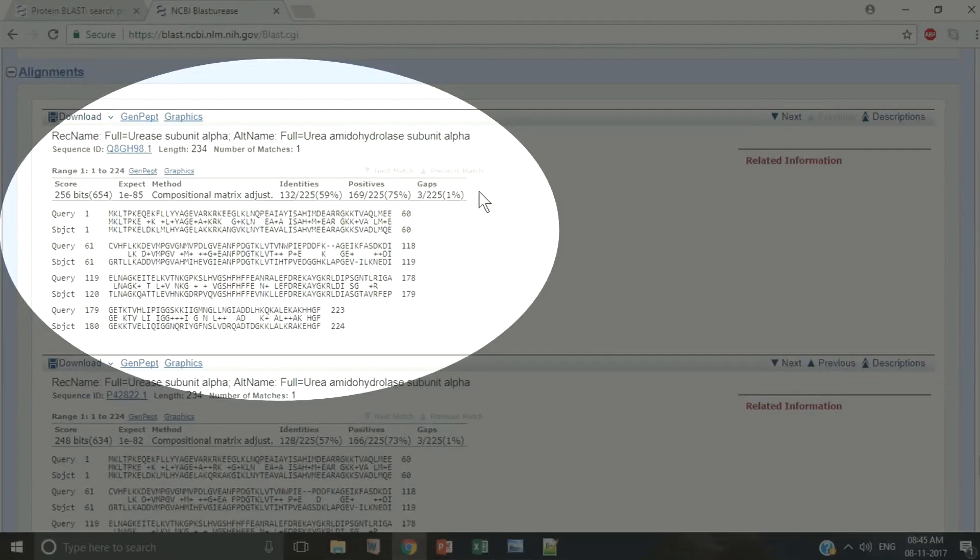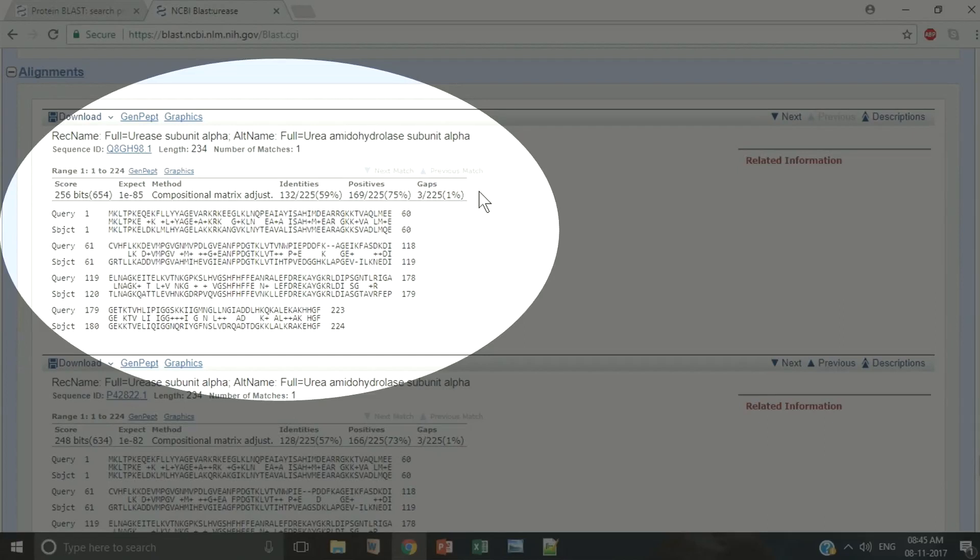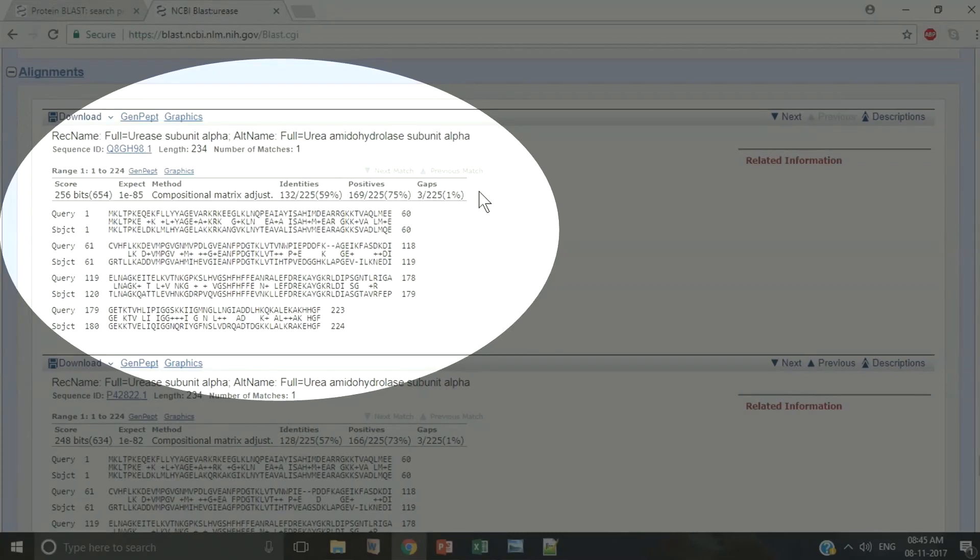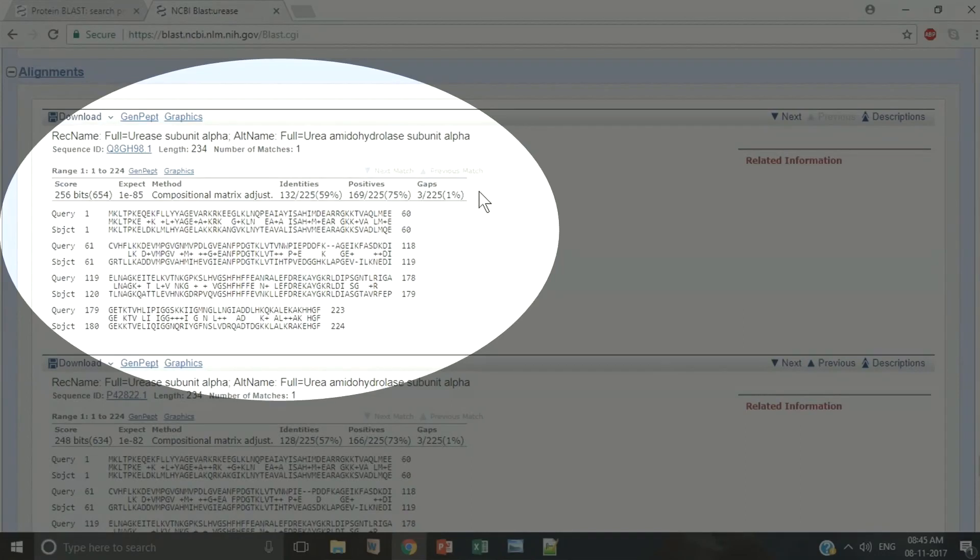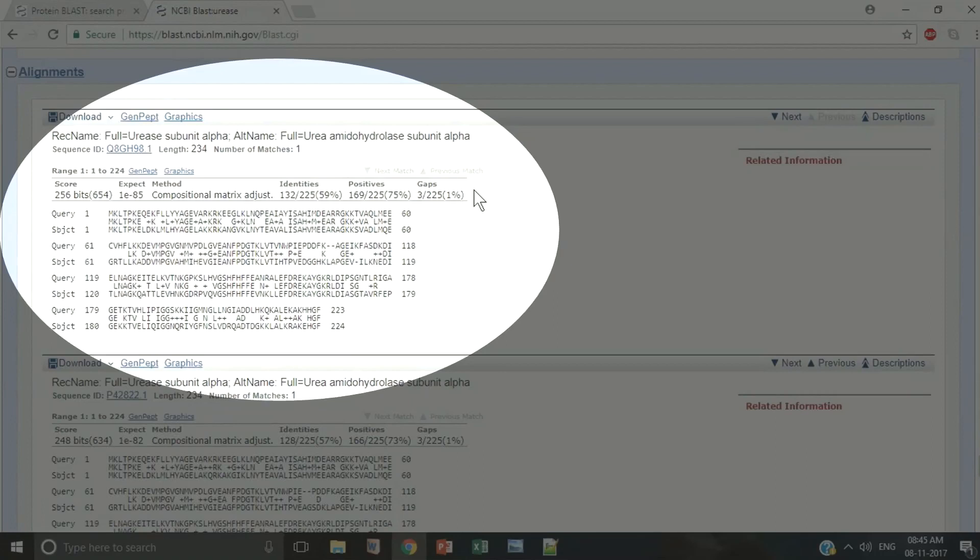The sequence alignments show us how well our query sequence matches with the target sequences in the database. Each alignment block begins with the summary of the maximum score, E value, sequence identity, and the number of gaps in the alignment. The alignment consists of three lines: the query sequence, the matching sequence, and the target sequence.